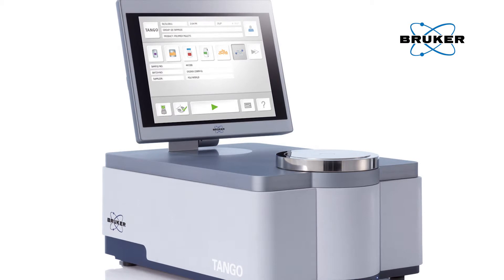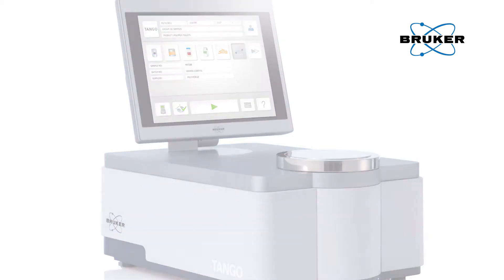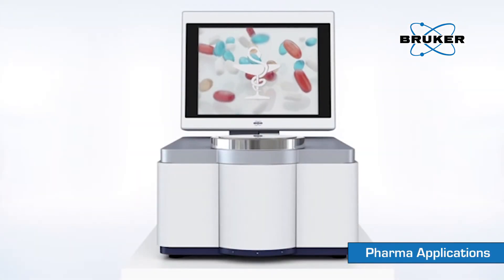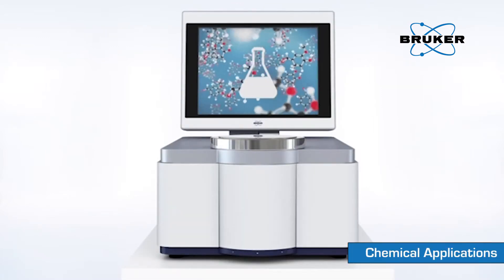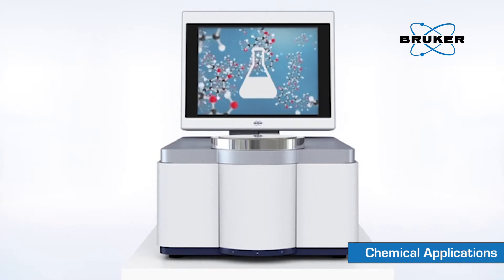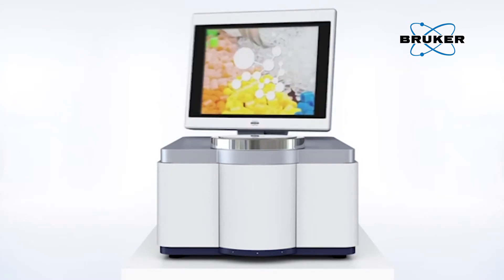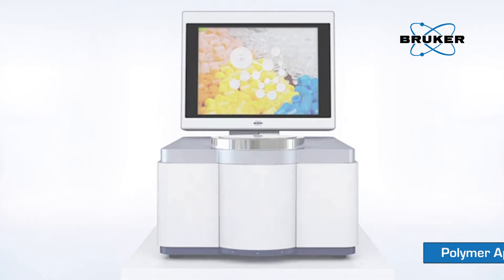Tango offers an efficient and cost-effective analysis for material identification and quantification in a wide variety of application fields. The comprehensive application support of the Bruker specialists helps to select the optimal measuring method as well as appropriate accessories and software solutions.